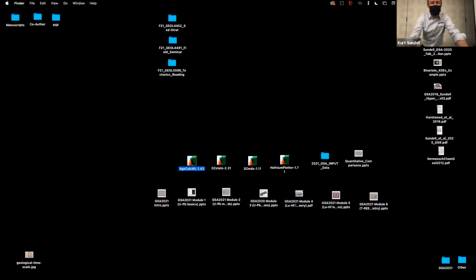So, yeah, go ahead and open up HCalc if you don't have it open already.